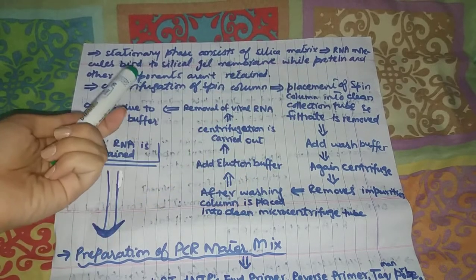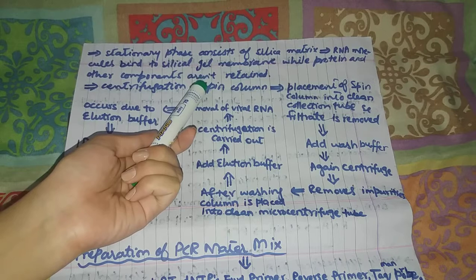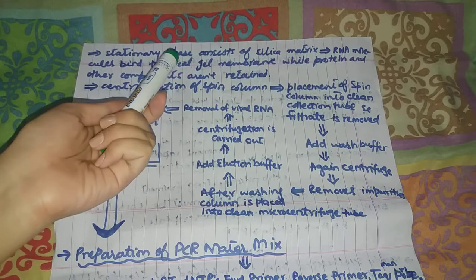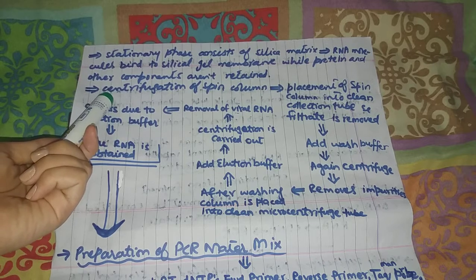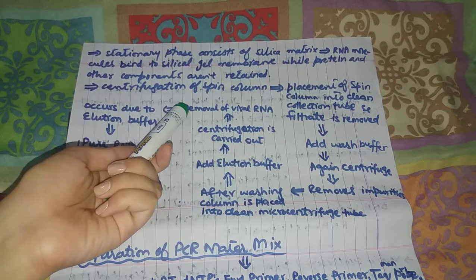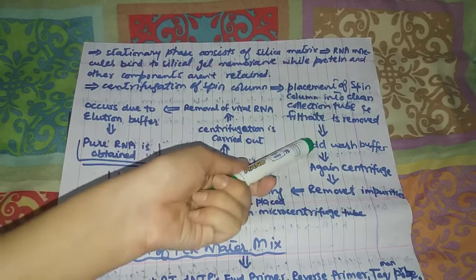The RNA molecule will bind to that silica gel membrane, while the protein and other components aren't retained. So when we go through solid phase extraction, our RNA will be retained, but the impurities, the undesired components, will not be retained. After this purification, we go for centrifugation again of that spin column. After centrifugation, we place it into a clean collection tube and the filtrate is removed.